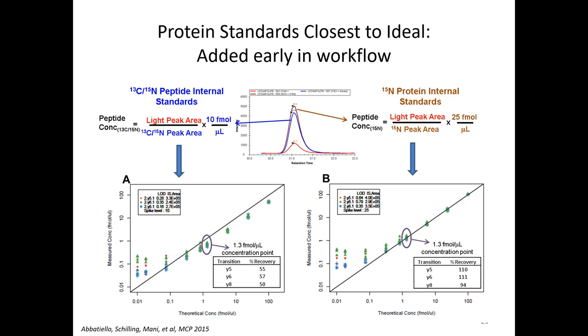Is it because the protein wasn't digesting? Is it because the synthetic peptide wasn't spiked in at the right concentration? It's really kind of hard to say.